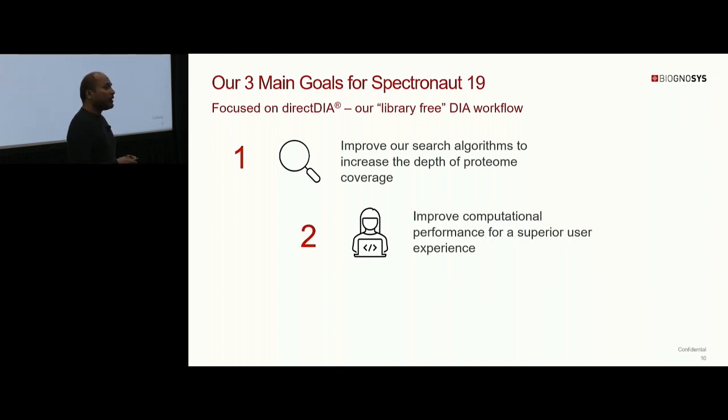Secondly, we recognize that direct DIA is a more computationally demanding workflow. So we don't want there to be an analysis paralysis, right? So we also wanted to really improve on that part.